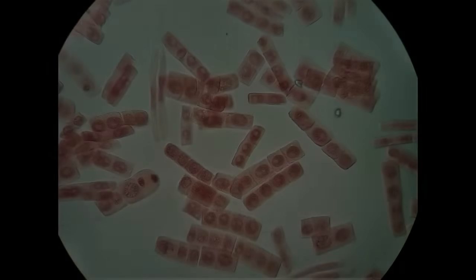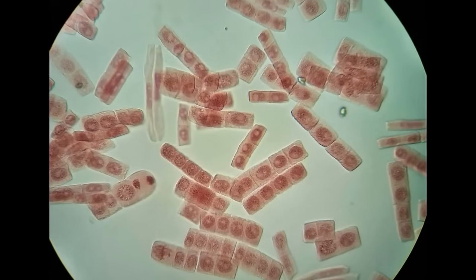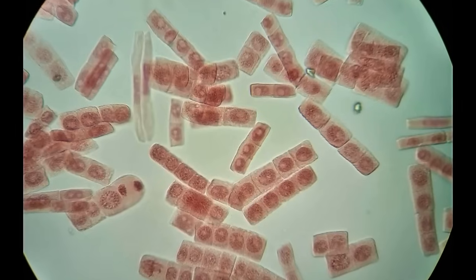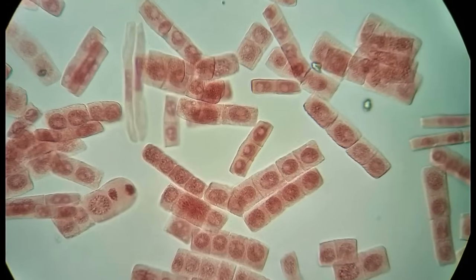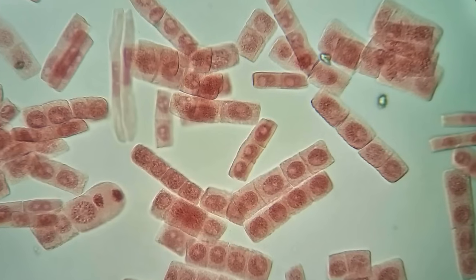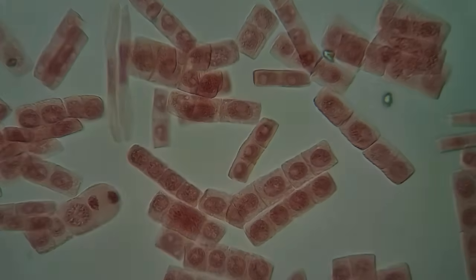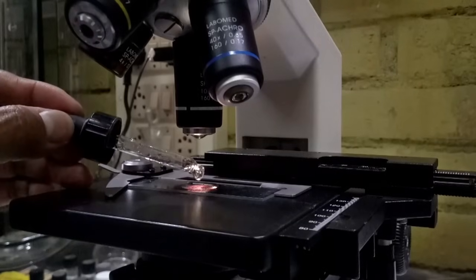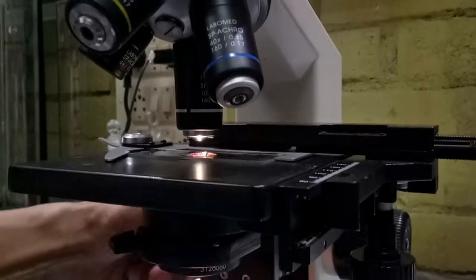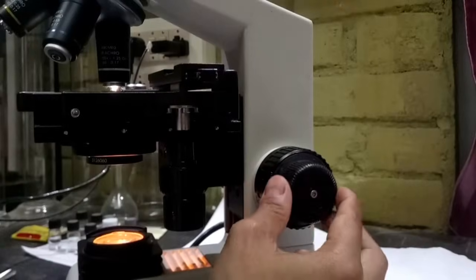This is how a finely squashed root tip appears under 10x of the microscope. As you can see, the cells of the root tips are nicely spread out with almost no overlappings. If root tips are not squashed enough, you may repeat the squashing process until you get well-spread root cells. Scan the slide for cells showing mitotic division stages under low power, then proceed to observation under high power, such as 40x or 100x oil immersion lens. For observations under the 100x objective, you will need to add a drop of immersion oil on top of the cover slip and gently lower the objective lens until it touches the oil surface. From there, use the fine adjustment knob for focusing.